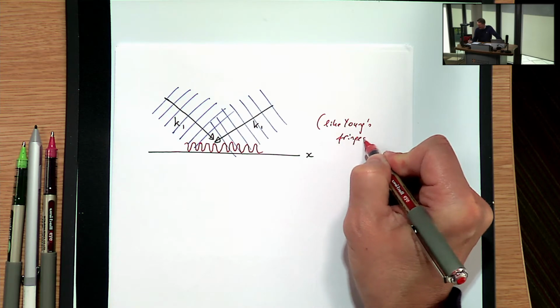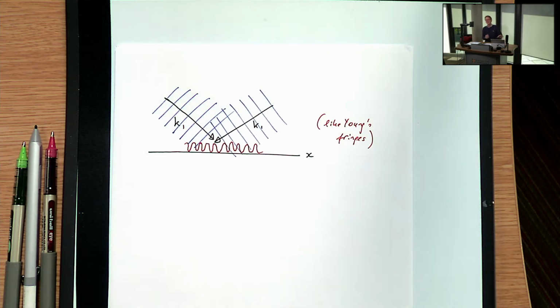And I want you to think about this in the previous picture in the arrangement on the computer. The fact is, I have two spots. I'm arranging two spots to be in the back focal plane of the illumination objective in epifluorescence, right? So these spots emit spherical waves, so to speak. They go through the microscope. They are turned into plane waves. So you get one plane wave coming this way, so that'd be K1 coming from this way, and then you get K-1 from the other way.